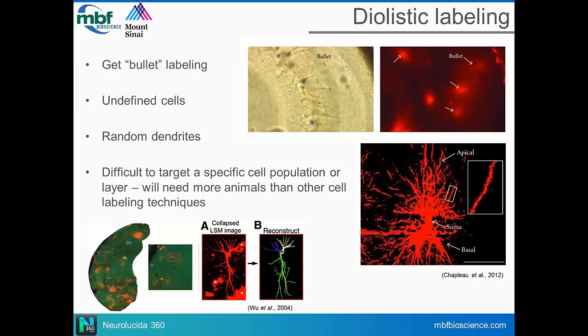We've done enough power analyses and published enough to show that's kind of the minimum number of samples that you really do need to get good statistical significance. Right. So an automated method for reconstructing those neurons and modeling those spines may be of interest to not just you, but a few other folks as well.